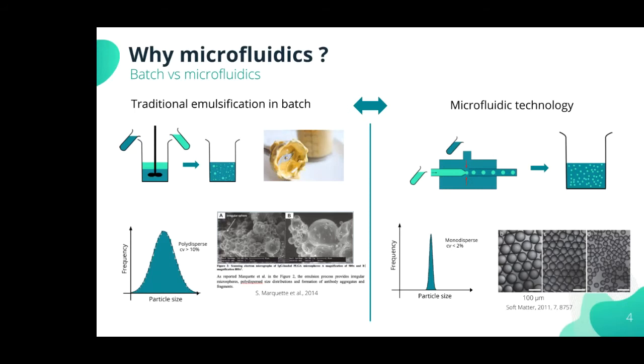In the case of encapsulation of a therapeutic molecule for drug release, for example, the width of the distribution can be a key factor for fine control of the drug delivery over time. And in the case of the production of beads for chromatography purification, for example, the size distribution of the beads is directly correlated with the resolution of the separation.